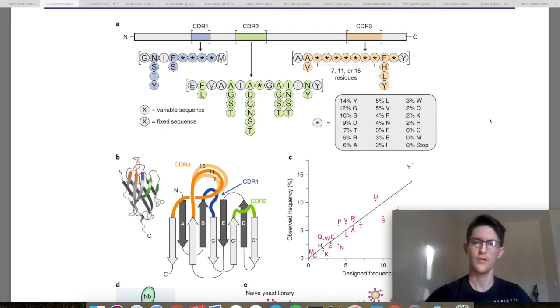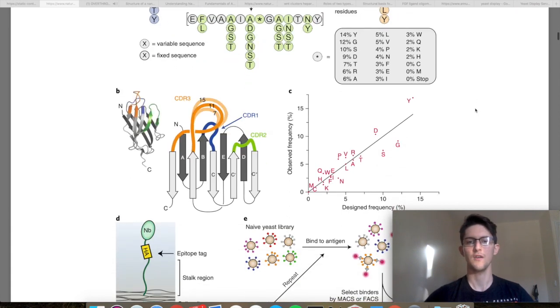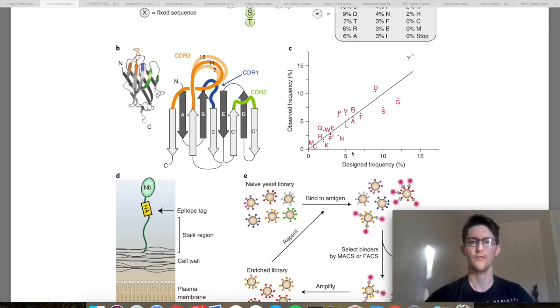So they went through and, based on popularity of certain residues in certain positions, they generated a library with variable residues in the positions of the asterisks in each one of these. And using a very, very convoluted PCR method, they were able to generate a library that we predicted would have this diversity. Figure 1c shows a graph after sequencing, so they had some 480,000 sequences analysed.